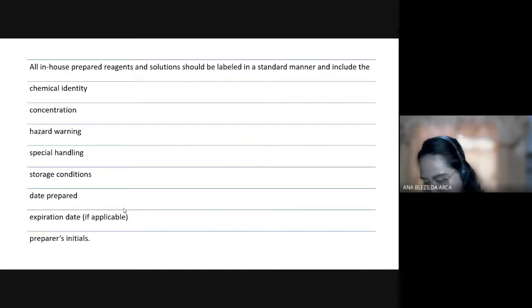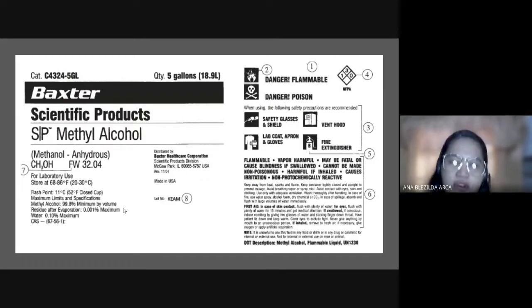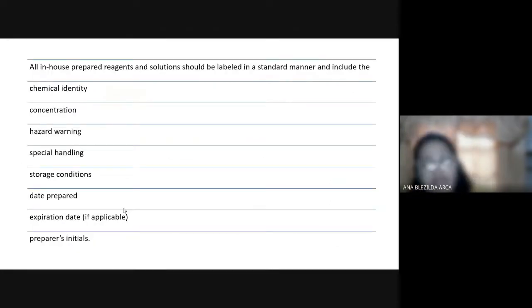Ngayon, paano naman kung yung chemical niyan is prepared in-house? When you say in-house solution, ibig sabihin nun, class, ikaw mismo yung nagtimpla ng mga chemical. Kasi, yung pinakita kong sample kanina, ito yung mga chemical na nabili mo, na prepared na siya. Prepared solution na yan eh. So usually nasa bote 'yan o kaya nasa galon, 'di ba? Ngayon, ito naman in-house prepared. Ibig sabihin noon, meron kang powder na chemical tapos tinimpla mo siya into a solution. Nag-prepare ka ng solution from that.